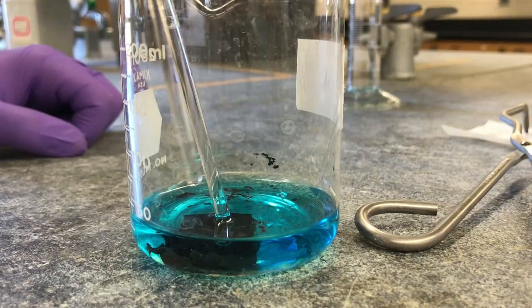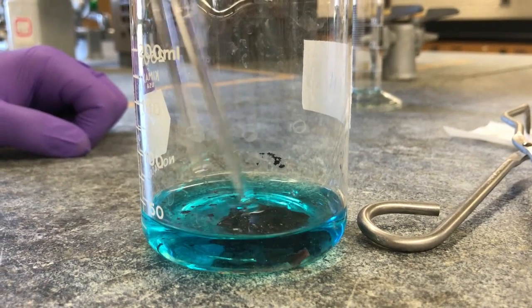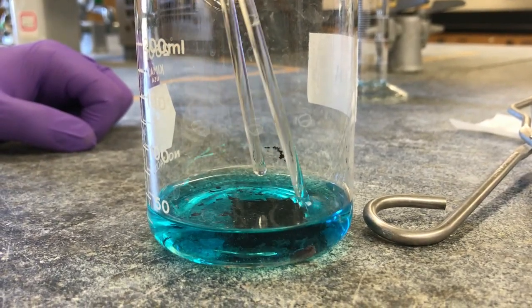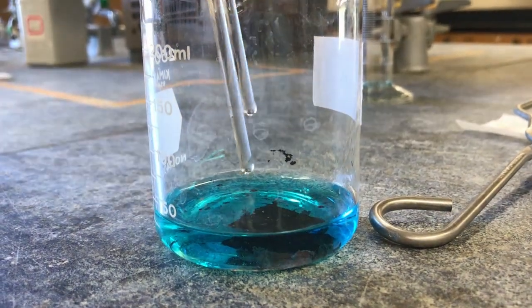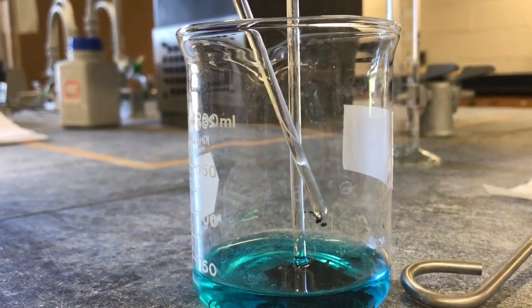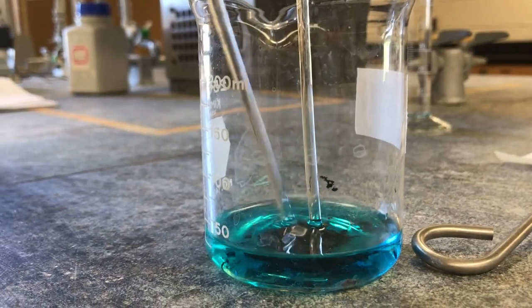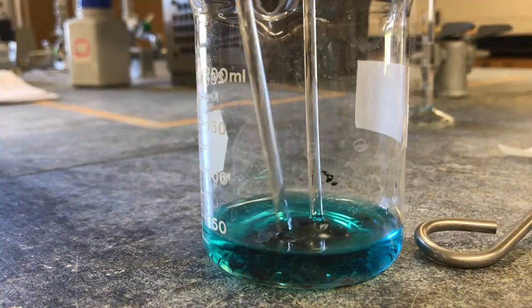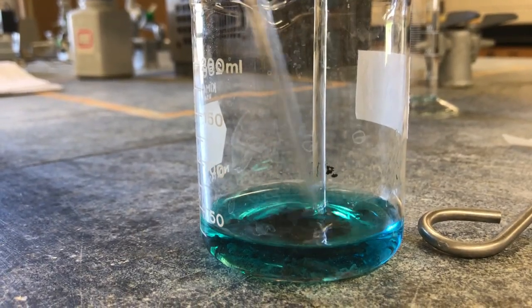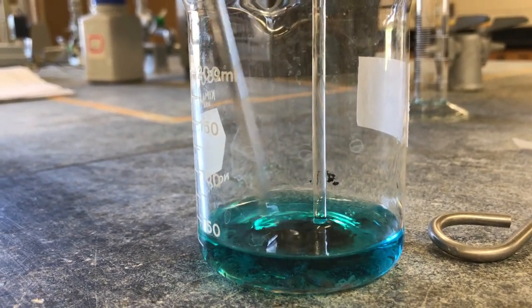What we're going to have to do is scrape the surface of the zinc, because it's currently reacting with the copper chloride to form zinc chloride and copper metal. And these chunks are what we see of the copper metal. So one thing that you can do is place one of these glass stirring rods, thank you, hold down the zinc piece with one and just scrape with the other, obviously being careful that you don't shatter these glasses. But the faster and harder that you scrape, the faster that this whole process works. This will take a while.